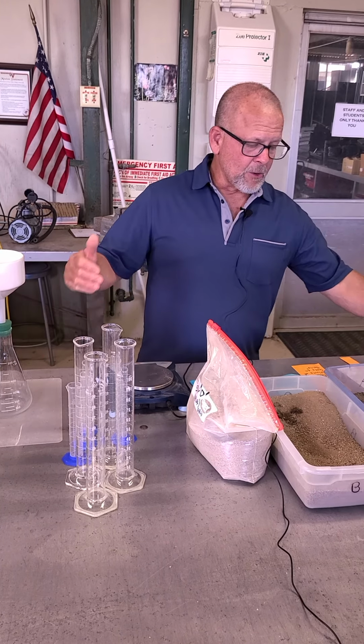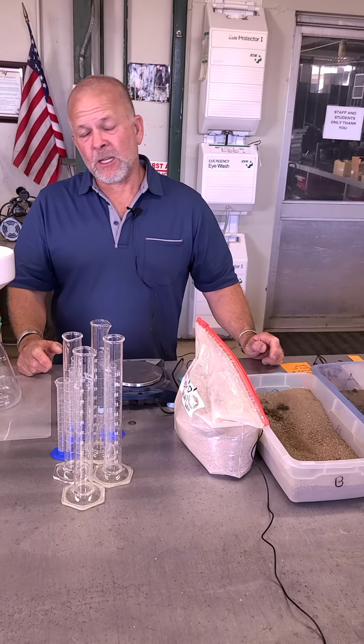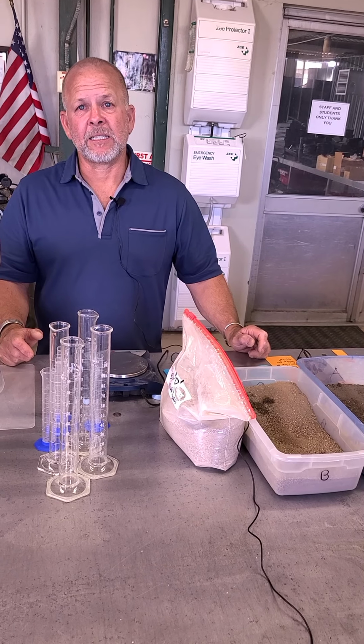So what we've got going on here today is 3 different soil textures, 3 different soils we've picked for you. One of them is a loamy sand. One of them is a silty clay loam. And the last one is a very nice classic loam.